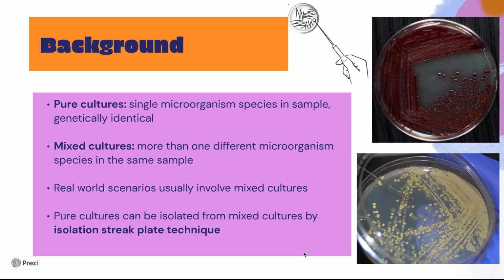So when discussing microbes, it is important to understand the difference between pure and mixed cultures. A pure culture contains a single species of microorganism that is genetically identical. This means it's free from contamination from other microorganisms and can thus be studied for specific properties or be identified in a laboratory setting.